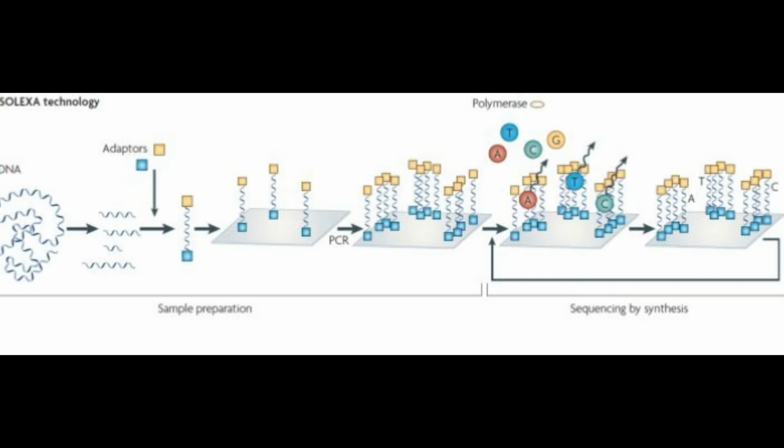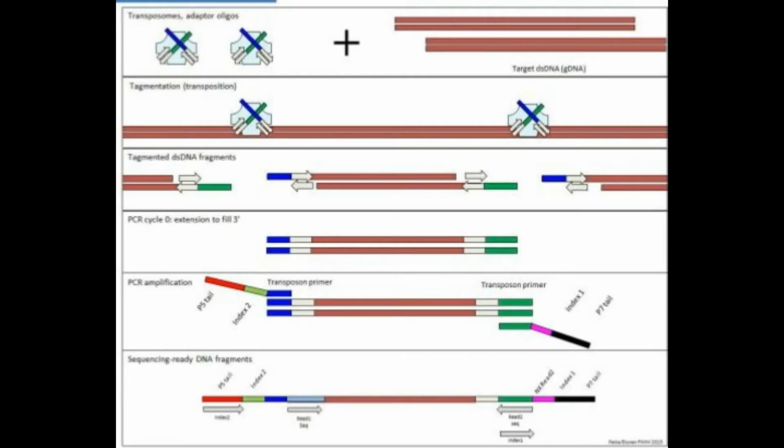The library preparation can be done by transposition, which is part of Nextera technology. The Nextera approach utilizes the transposon activity in forming the Illumina compatible paired end libraries. In this assay, the DNA is simultaneously fragmented and tagged with a sequencing adapter in a single reaction. The Nextera transposition is a random event on the template DNA molecules, but it may favor certain sequence regions over others. So lowering the copy number of input DNA molecules decreases the diversity of the libraries, and hence it affects the sequencing result.